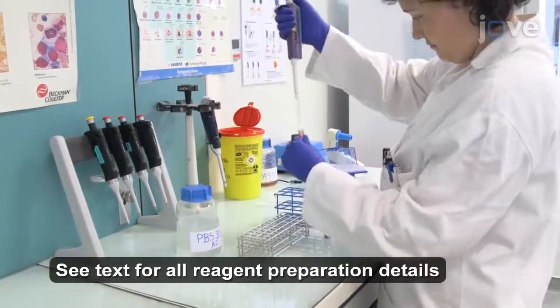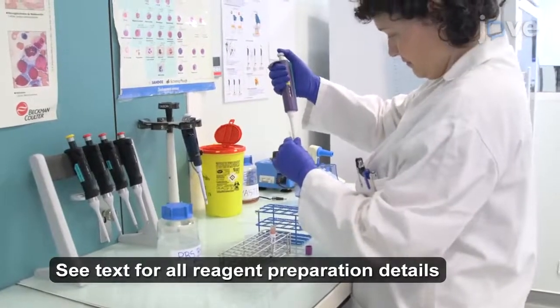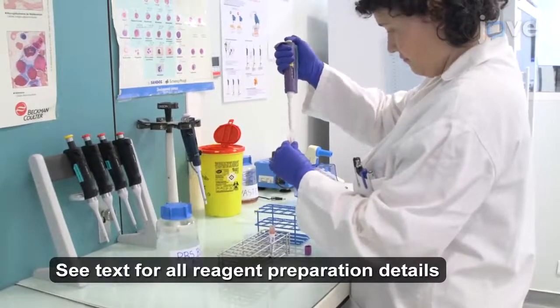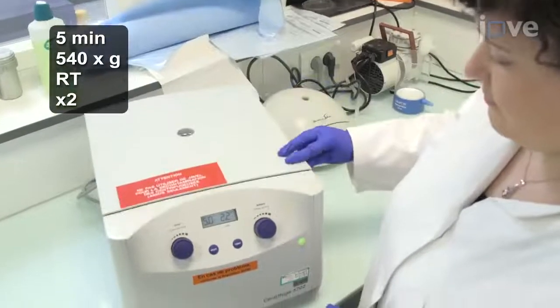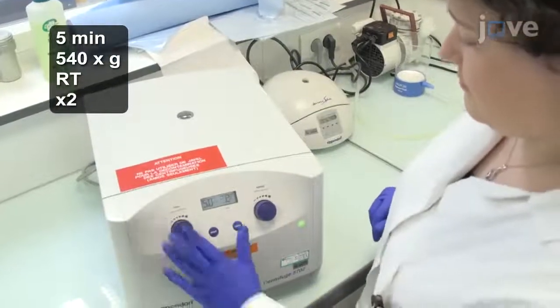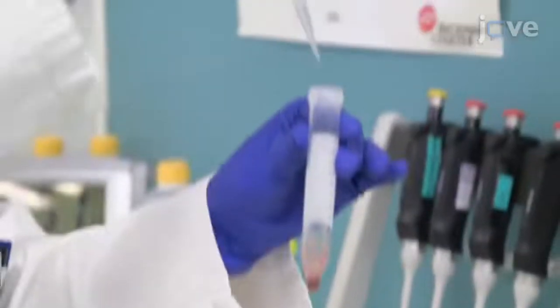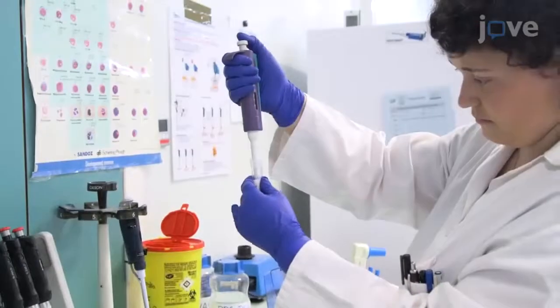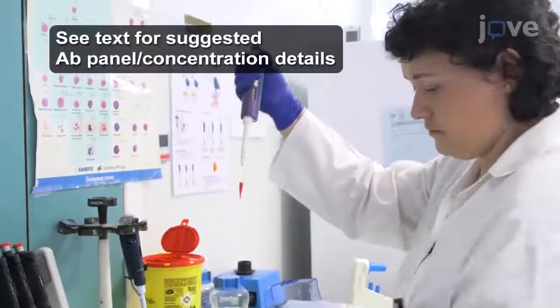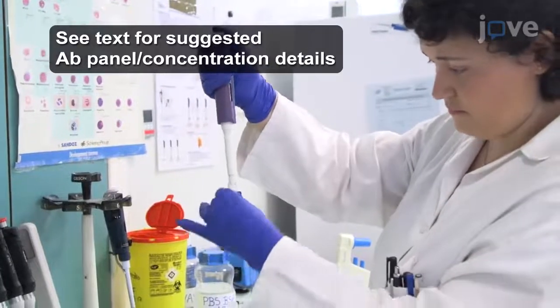Begin by mixing 600 microliters of the primary cell sample with 10 milliliters of washing buffer in a 15 milliliter conical tube for two centrifugations in 10 milliliters of fresh washing buffer per wash. After the second wash, resuspend the pellet in 400 microliters of fresh washing buffer and transfer 350 microliters of the cell suspension into a 5 milliliter polypropylene FACS tube containing the entire panel of backbone antibodies.